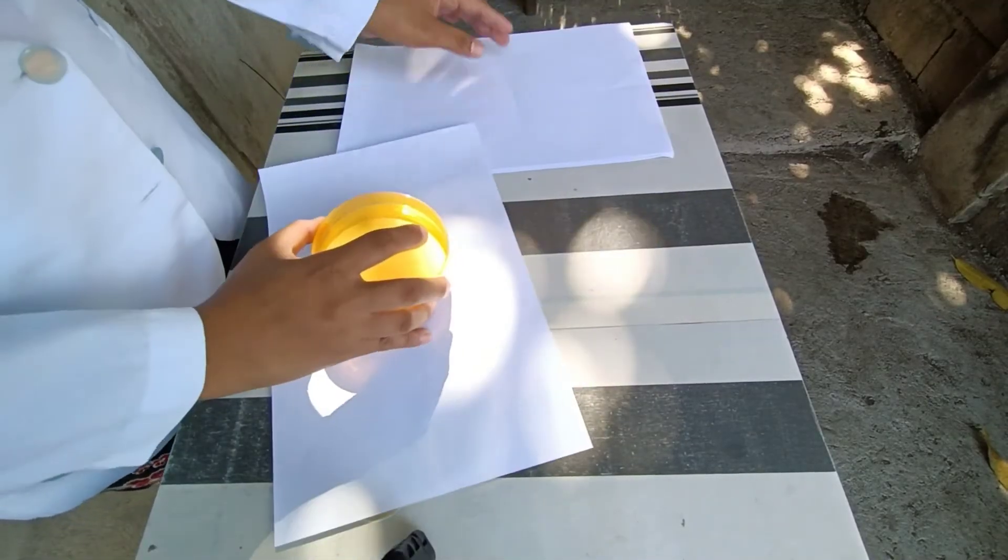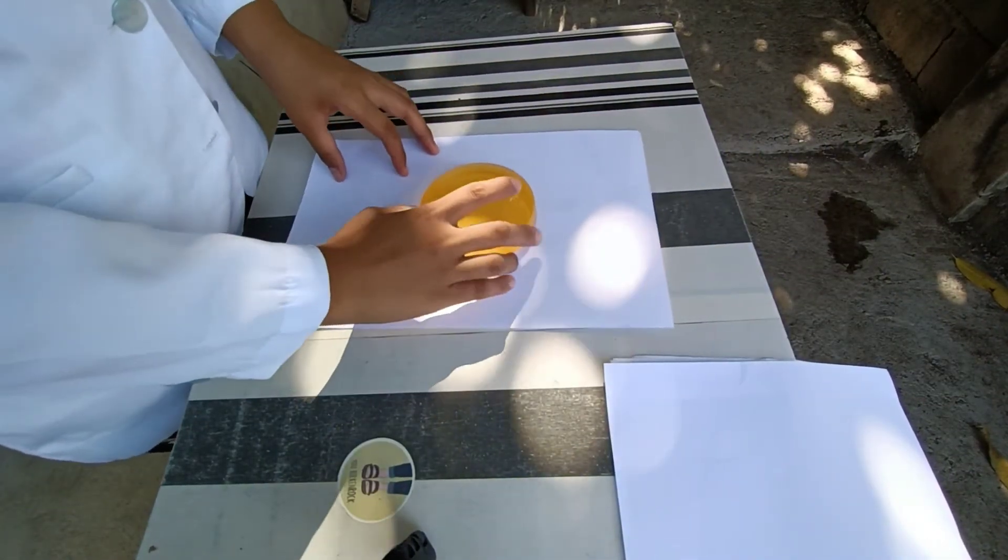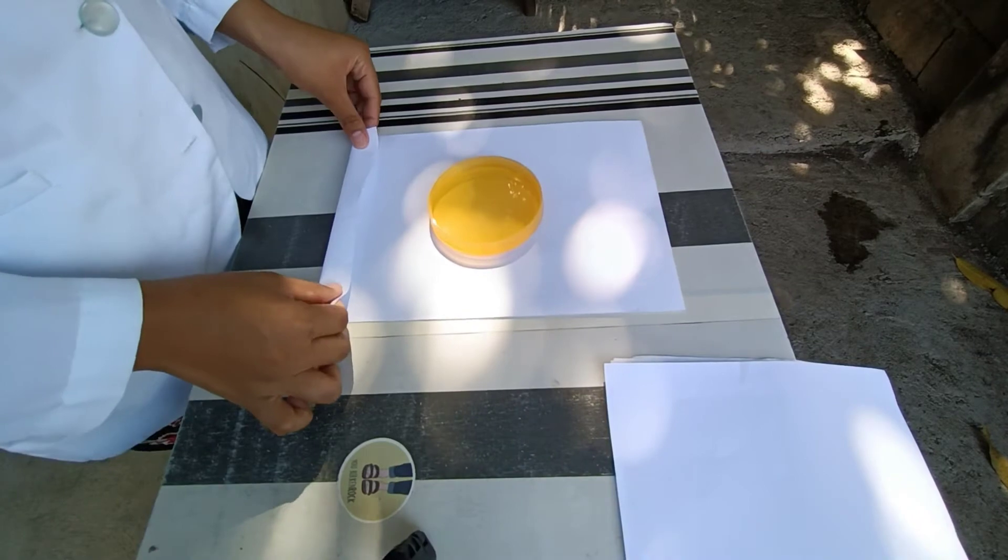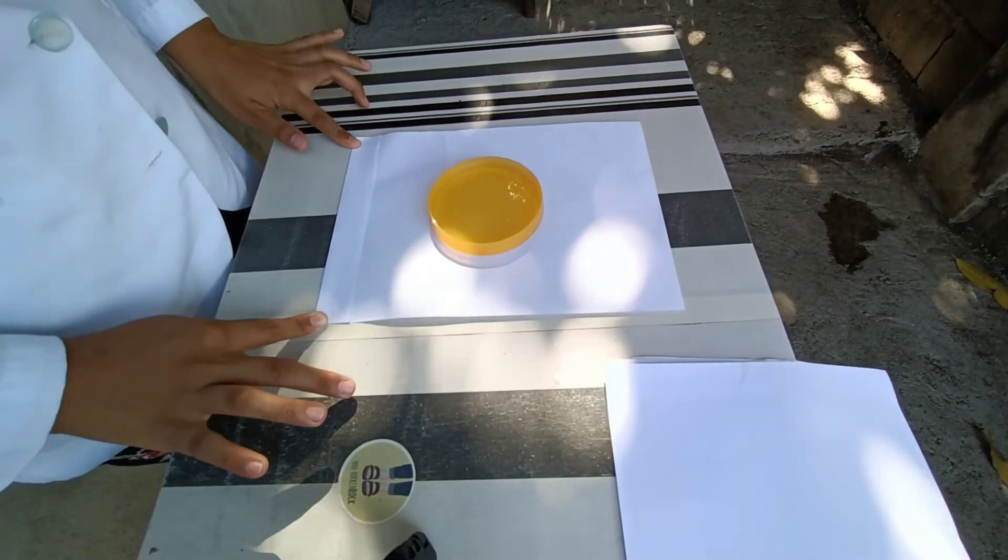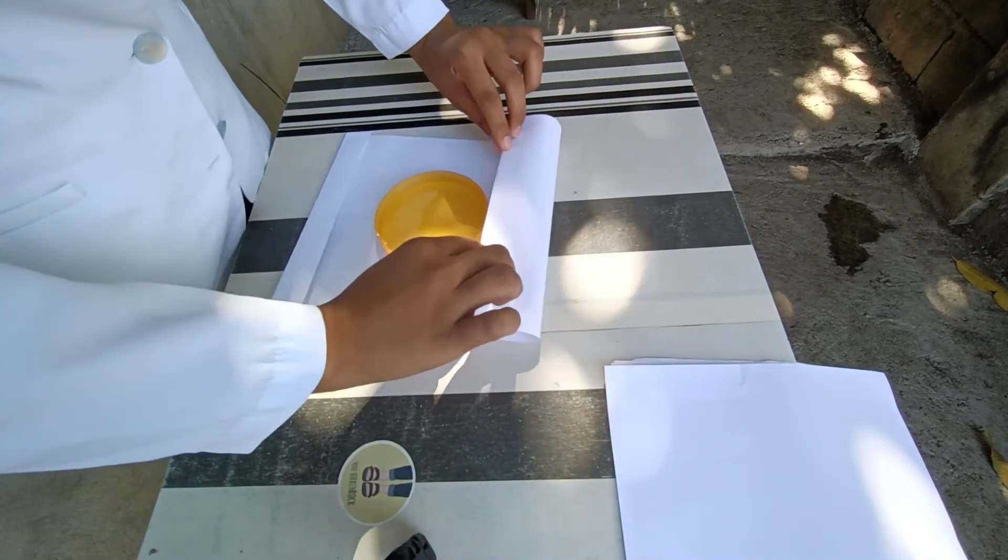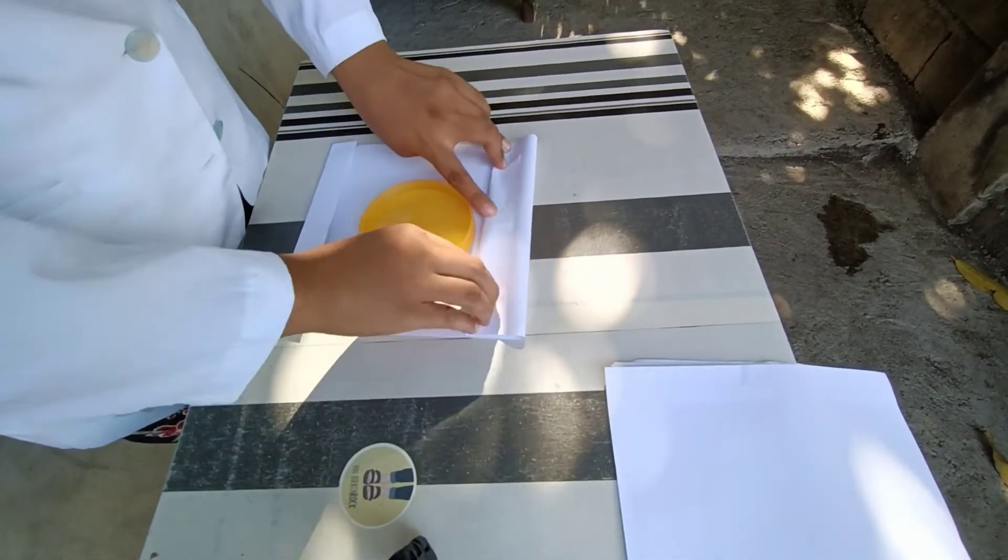Place the petri dish carefully in the center of the paper. Then fold the end of the paper approximately one inch in width. Fold the same on the other end but in the opposite direction.